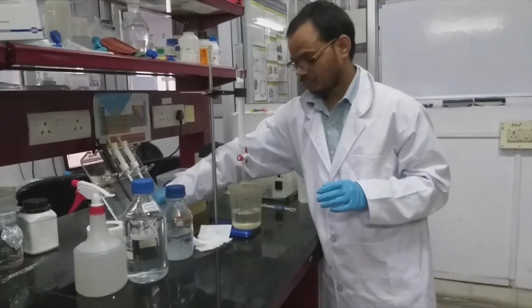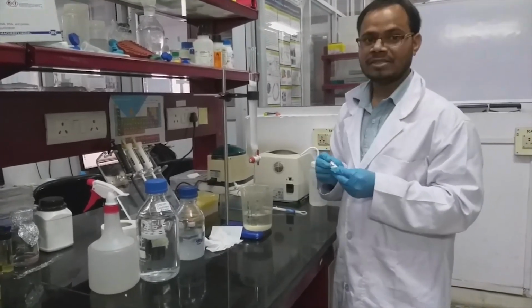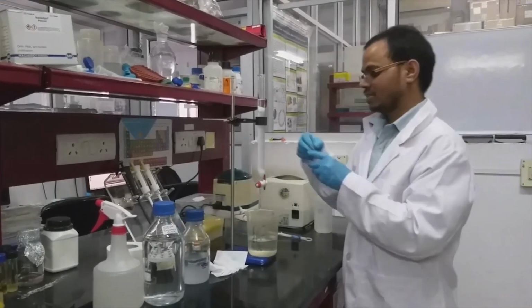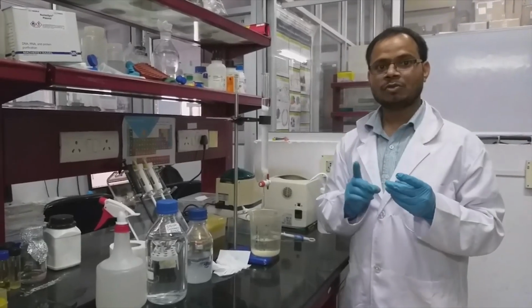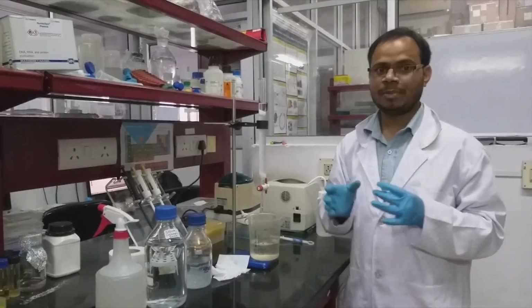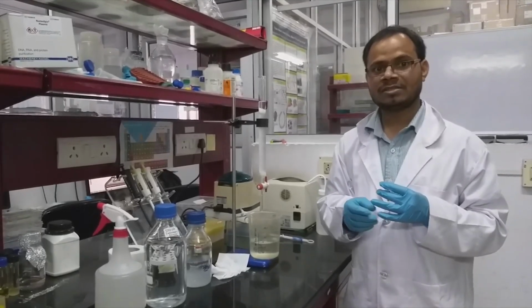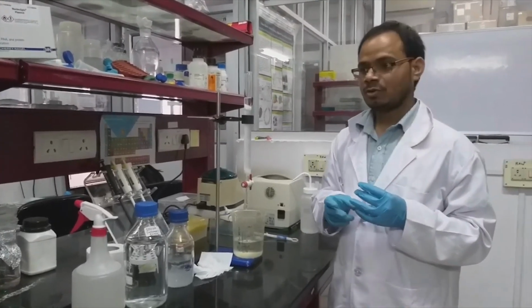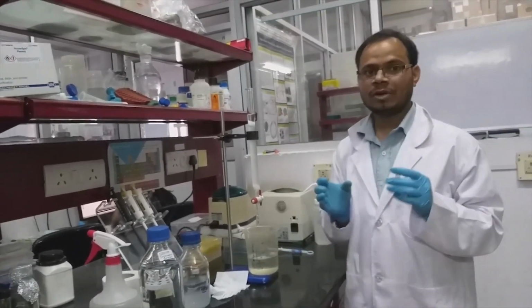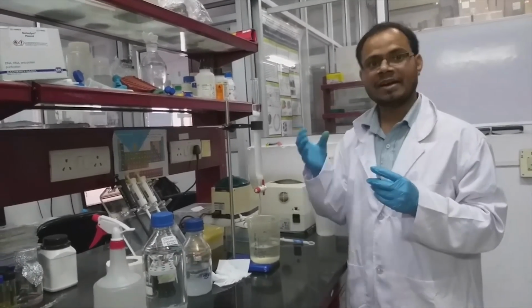So here, loading the sample, it is a better practice to load it with the beads rather than the sample alone. So what I am going to do is, this is our sample which contains one, 2000 kDa blue dextran, which is a glucose polymer, a polysaccharide, and the other molecule is a colored compound which is 0.5 kDa. So by principle, blue dextran elutes first, which contains blue color, and the small molecule elutes later onwards.